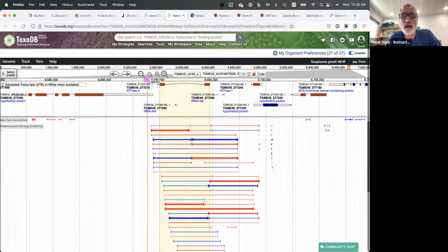And now we can take a look at this and you will see that there is an intron that goes from all the way up here, okay, and comes all the way down to the middle of this gene. And there are additional introns right here. And at some point, you start realizing that, wow, there's a bewildering number of possible splice variants or splicing going on in this region, right?